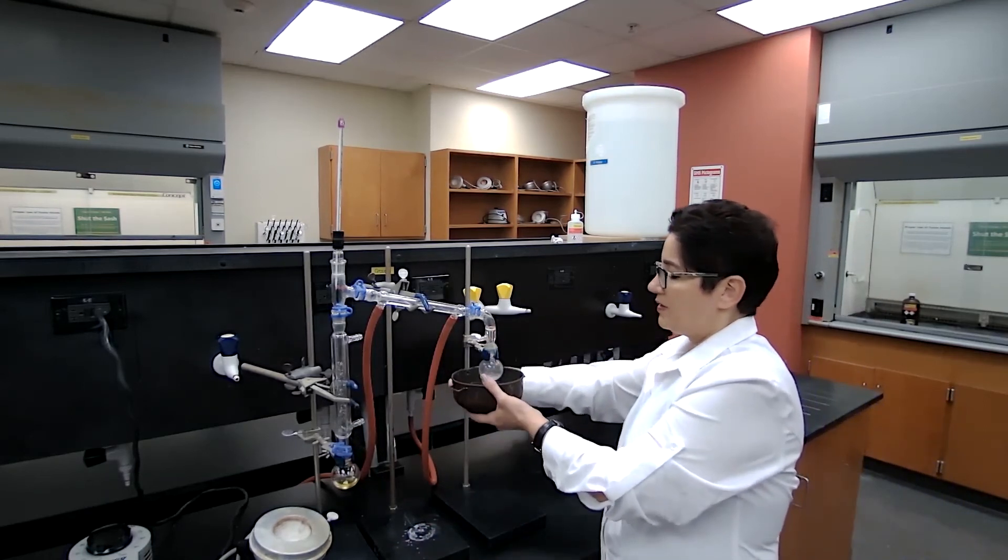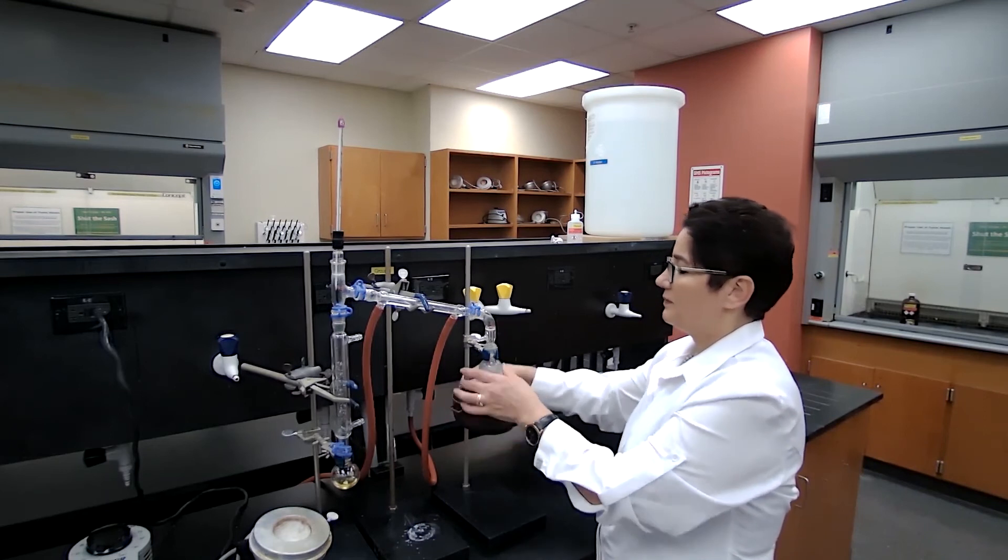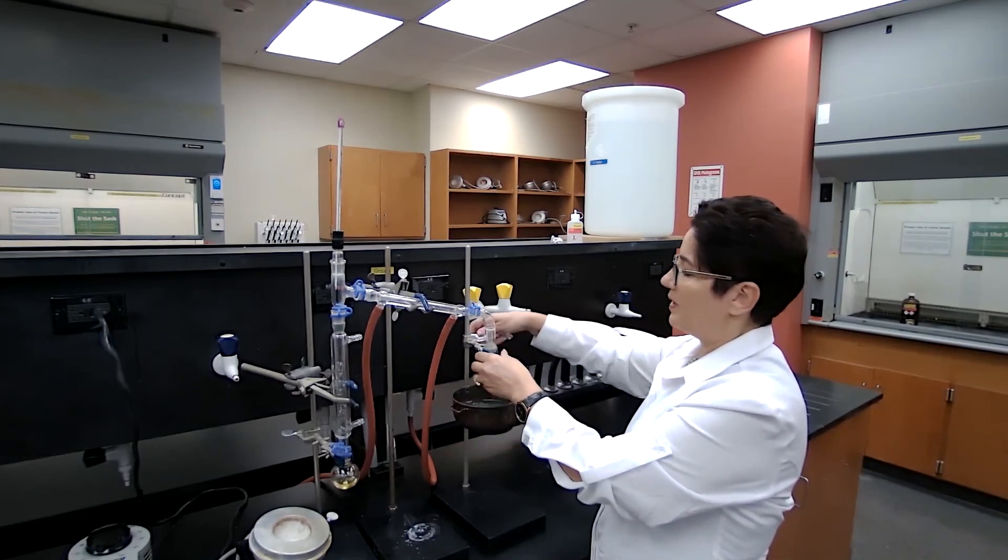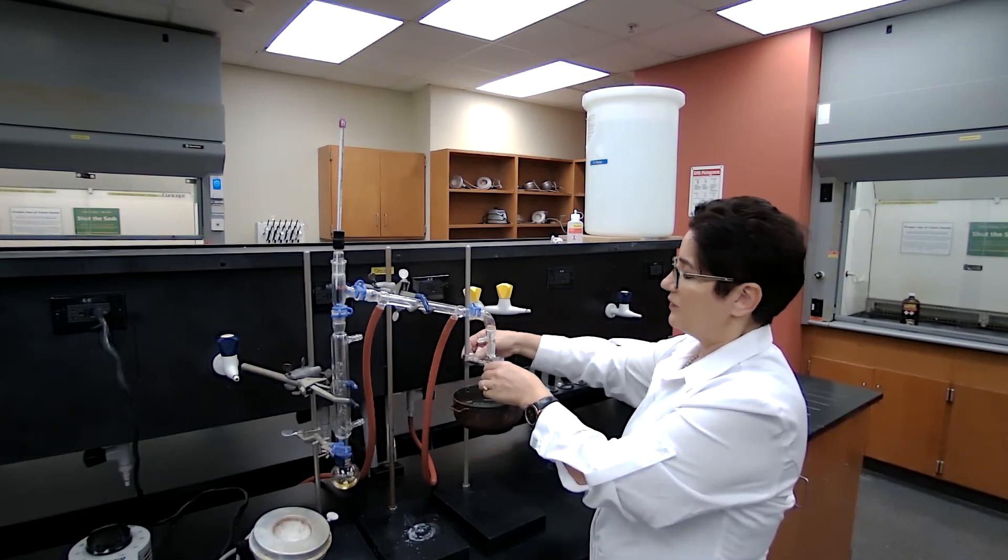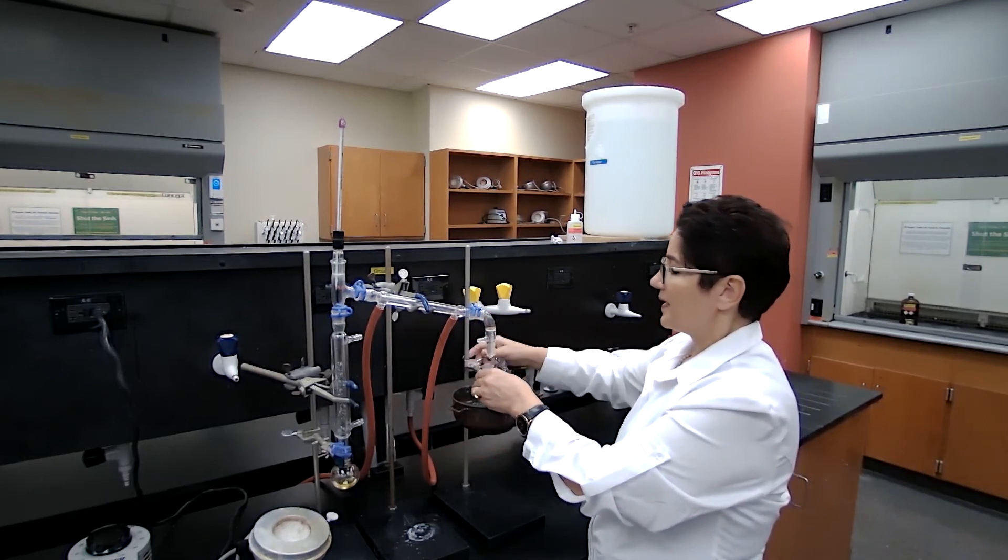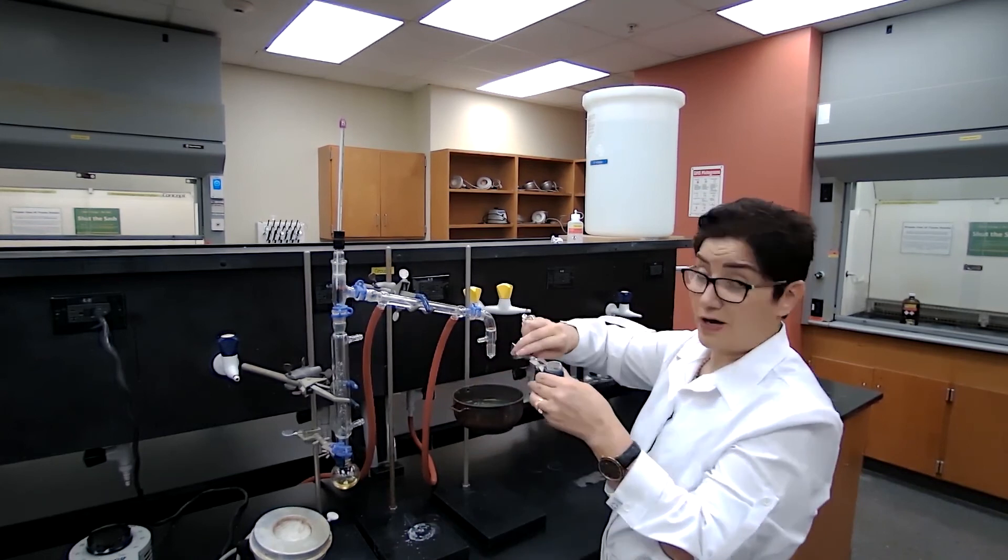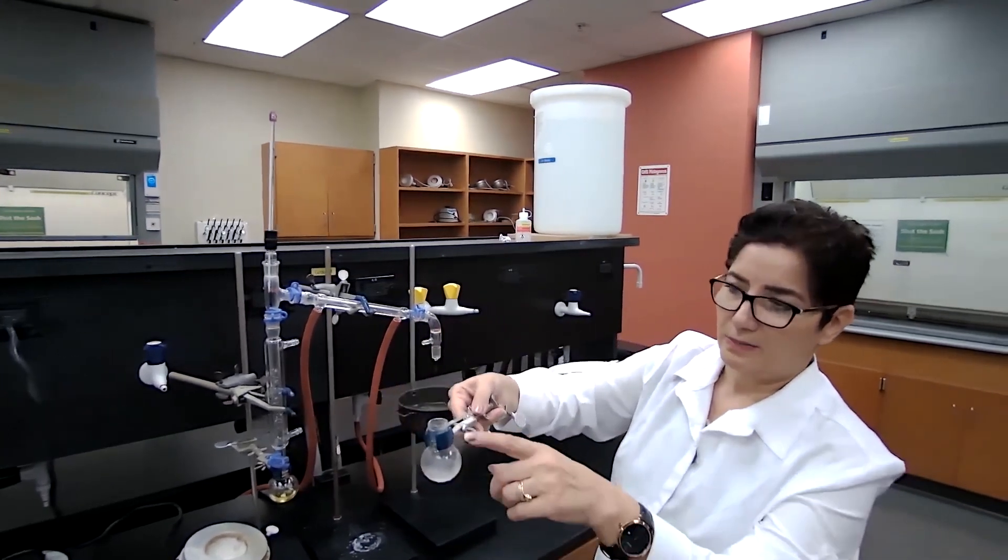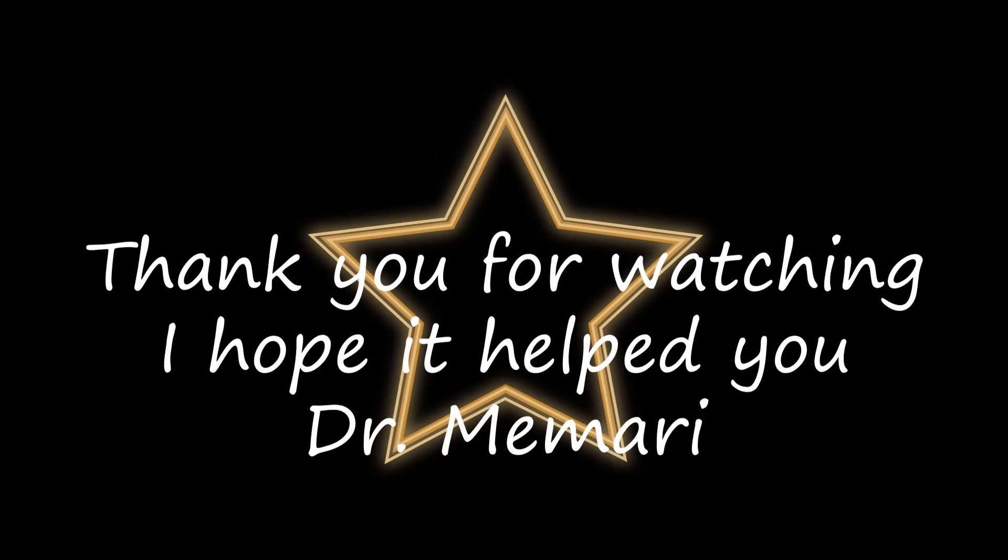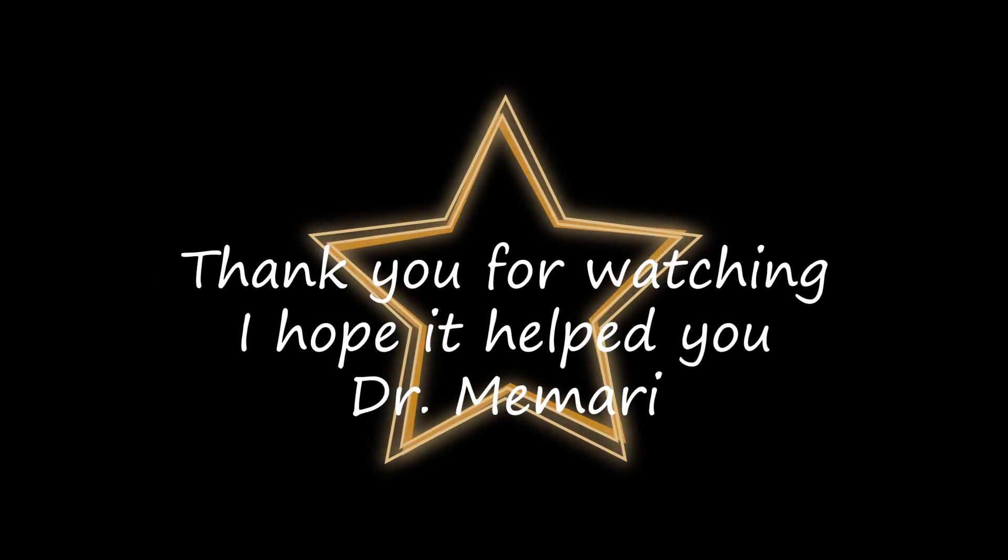For our product, we are going to clean up the product and purify it. I'm going to remove the receiving flask and transfer that. Following the procedure, we are going to transfer it into the separating funnel.